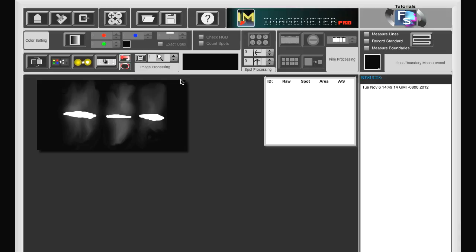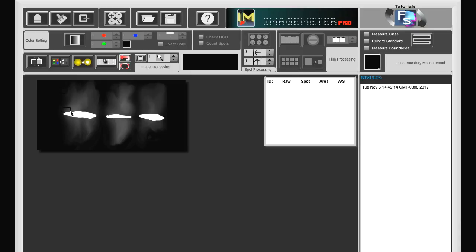If we want to have equal size rectangles, we can either preset the size of the rectangle, or there is a simpler way. We create the first rectangle.